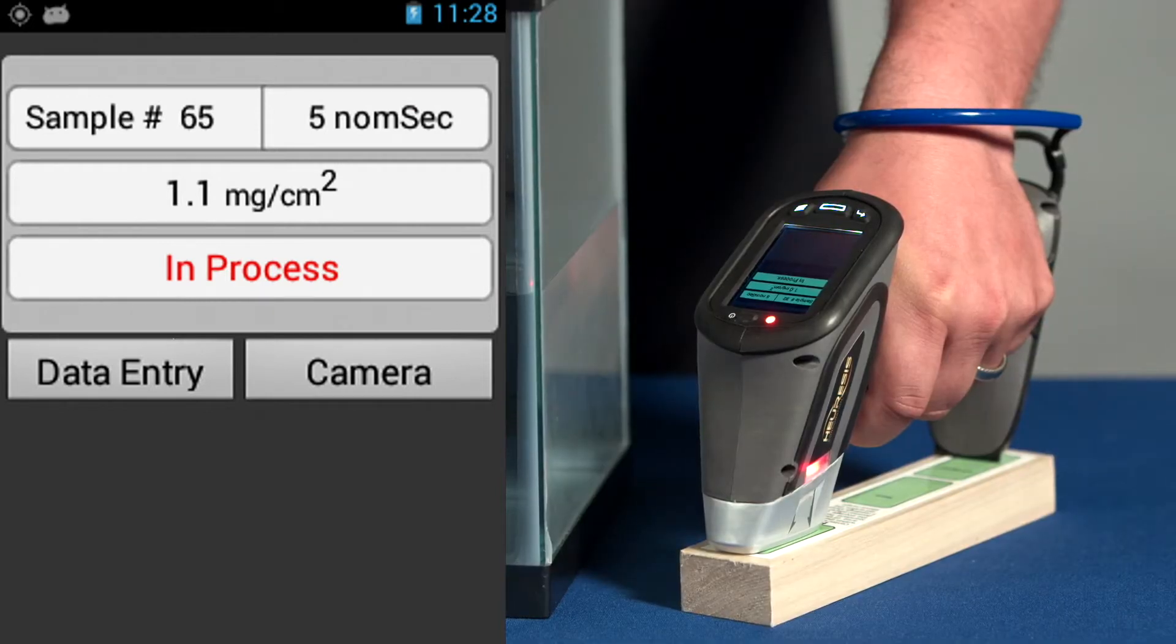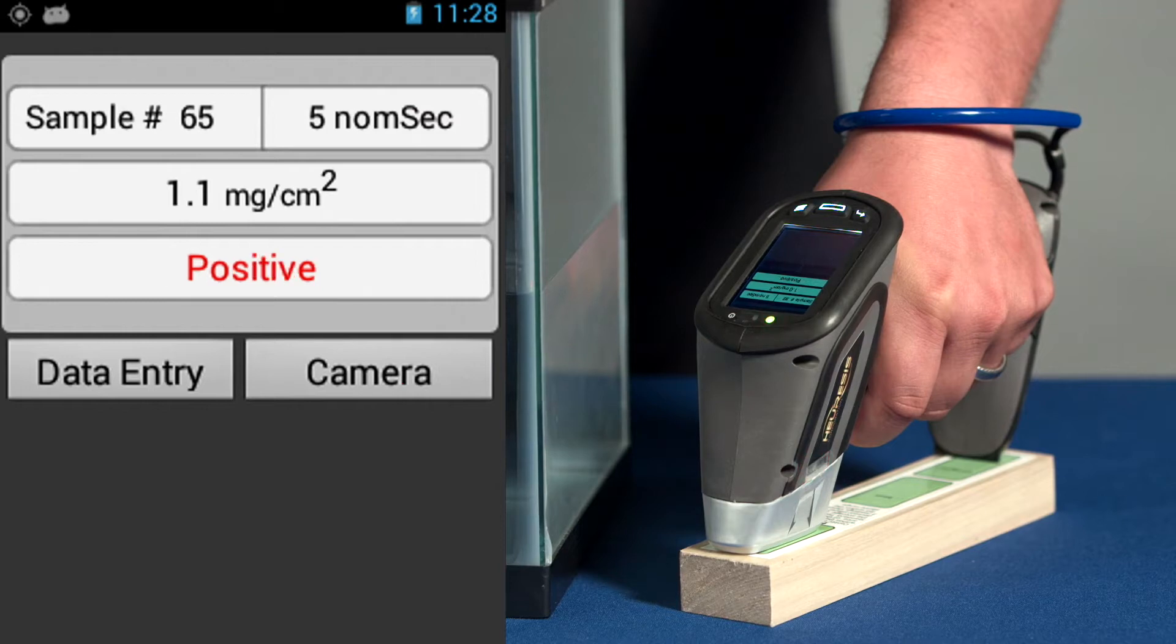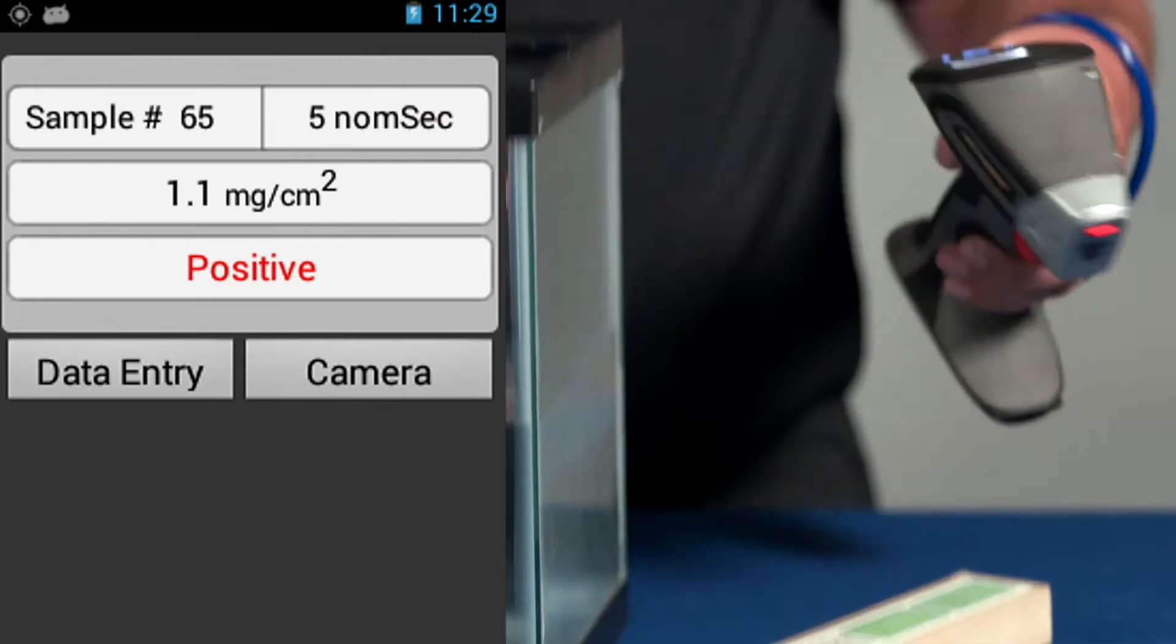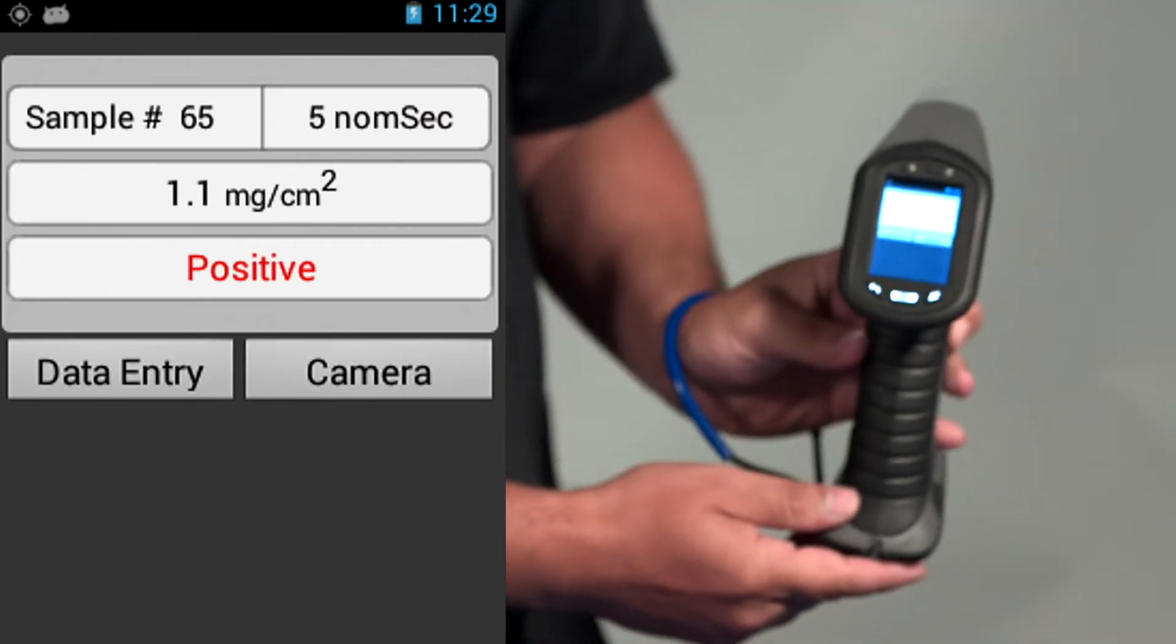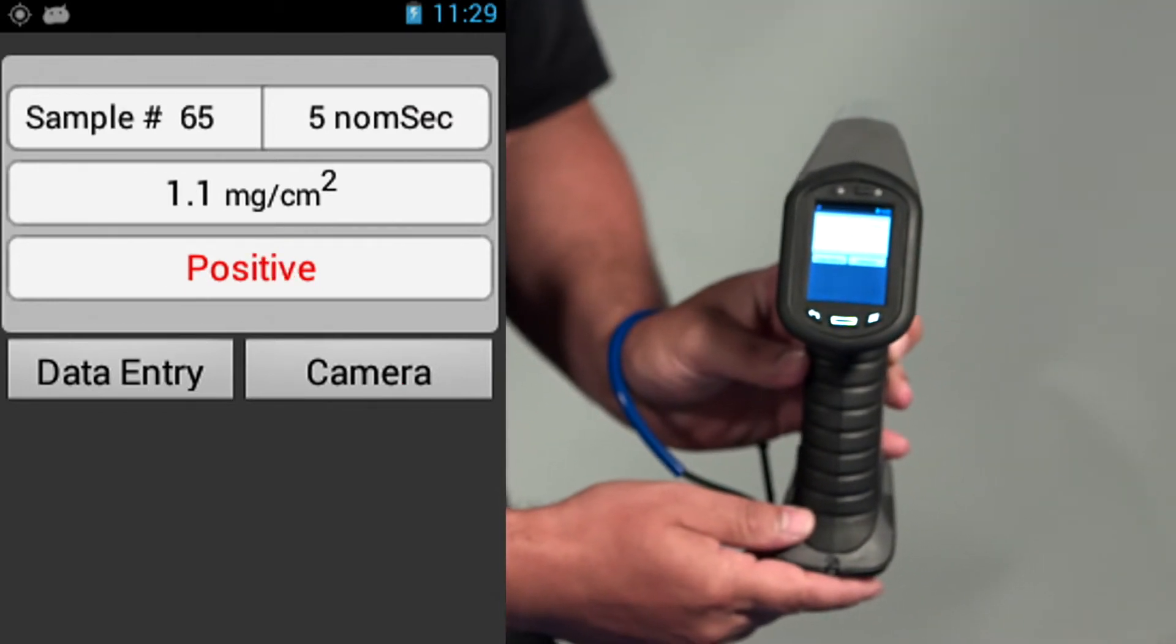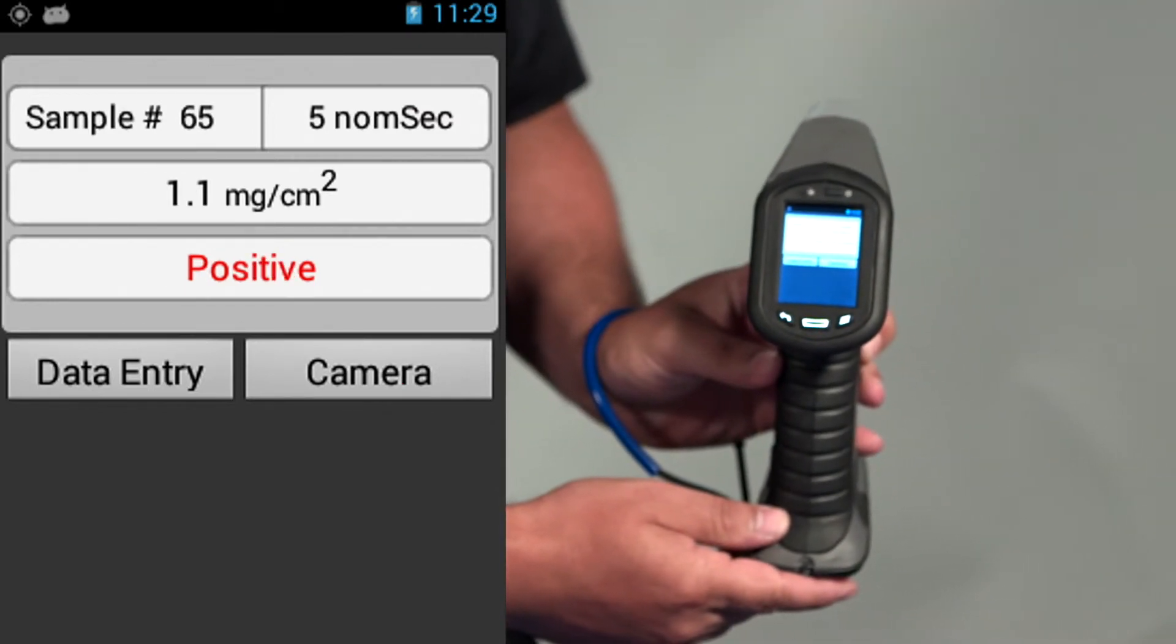If the average of those three readings comes between 0.8 and 1.2, the instrument is considered working properly.